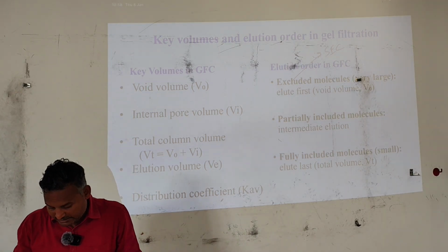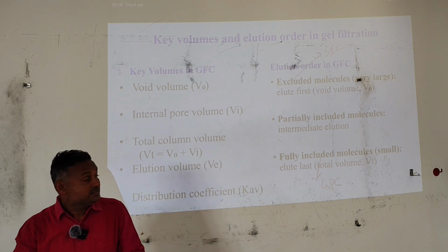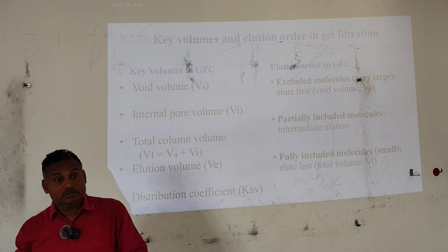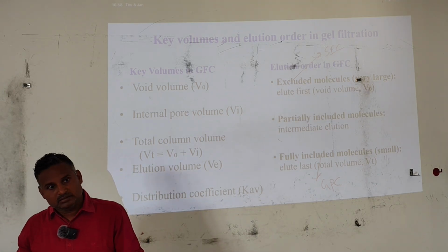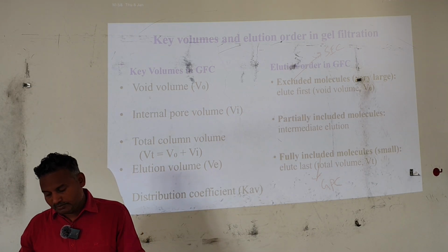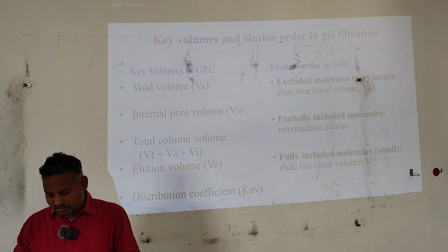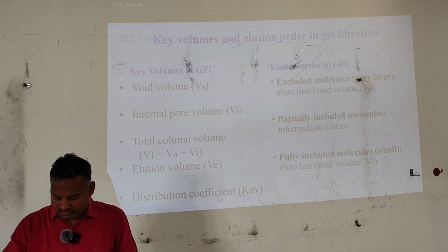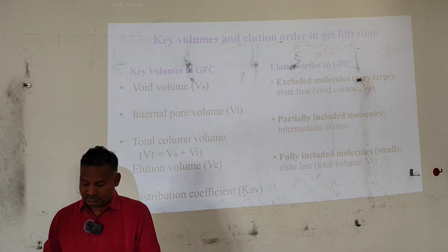We can say this one as GPC, gel permeation chromatography. Overall, it is GFC, gel filtration chromatography.